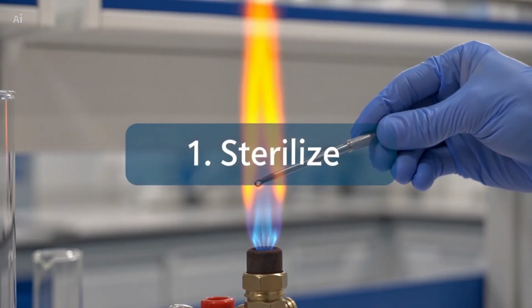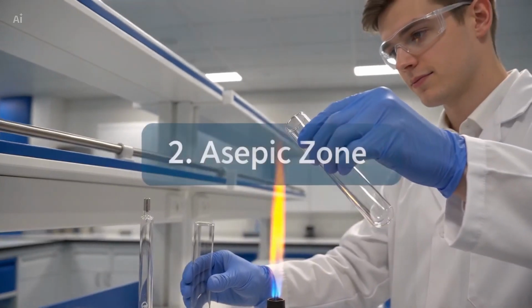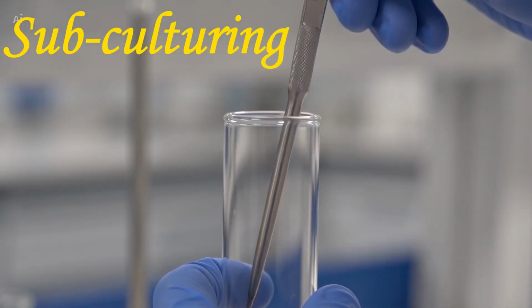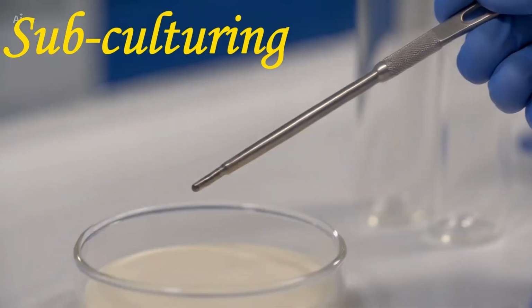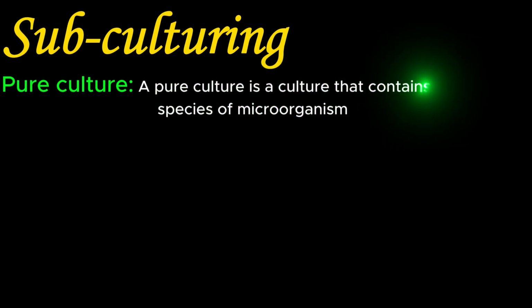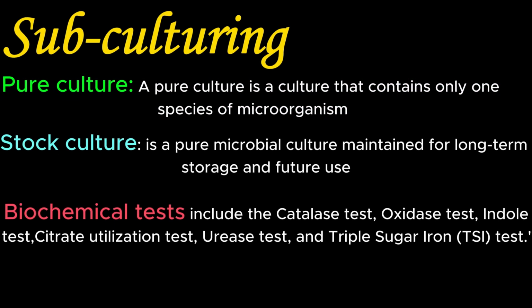In today's experiment, we'll learn one of the most important techniques used in microbiology, culture transfer technique, also known as subculturing. Subculturing is the process of transferring microorganisms from one culture medium to another under aseptic conditions. It is routinely used to maintain pure cultures, prepare stock cultures, and perform various microbiological tests.